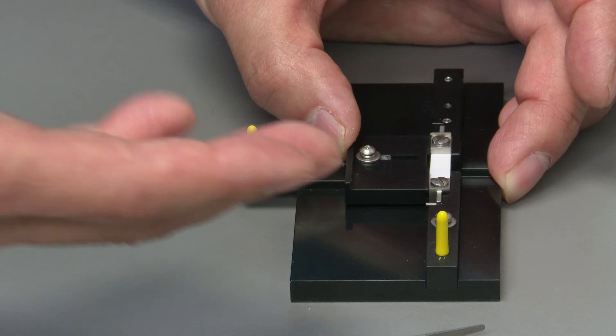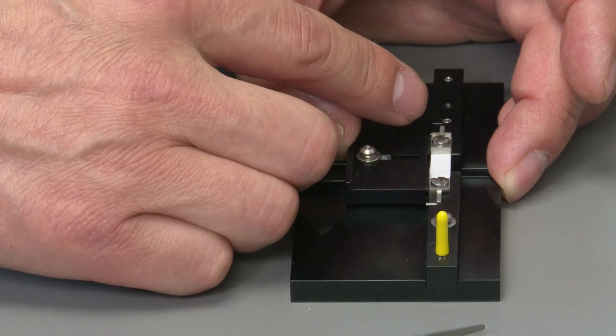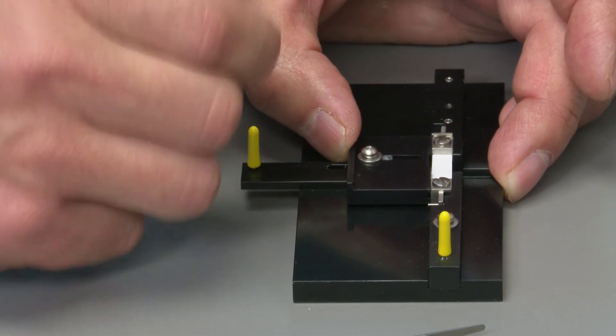Then you can use a caliper to measure the distance between the two clamps to get the length of the sample.